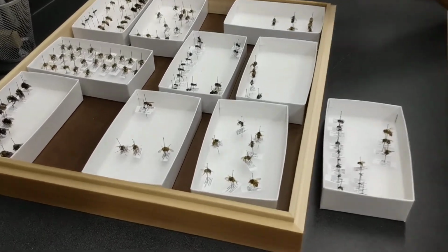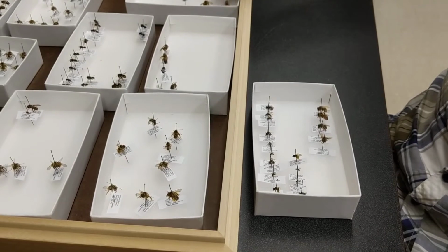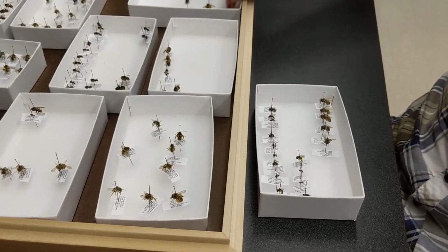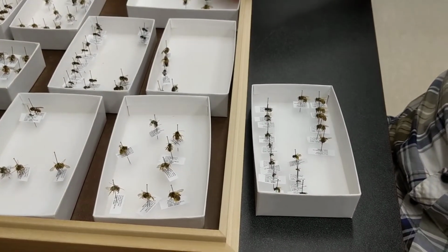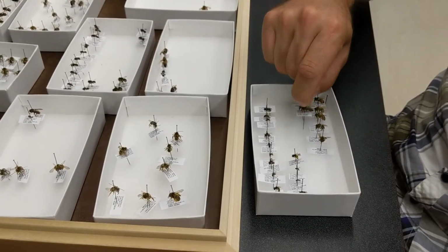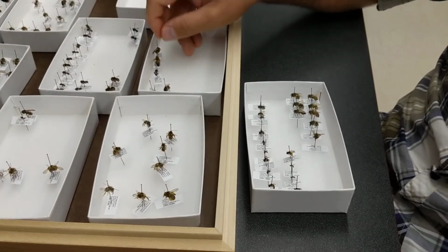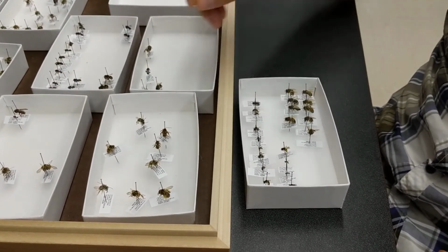There's actually a fair number of honeybees in here. This person really liked their honeybees. Yeah. Rest in peace. Okay, and so I guess the next step is you've now got your, for some people this will be the end point. They'll go through and figure out if they can get the genus, but for some of these groups like the Halictidae, they may go through one of the keys we've got up on the site, you can try and work through them yourself. That's right.